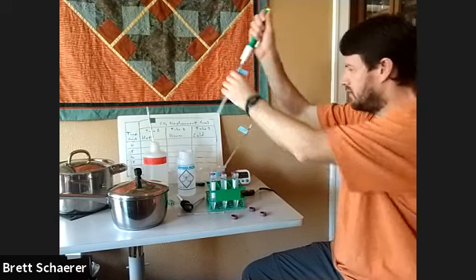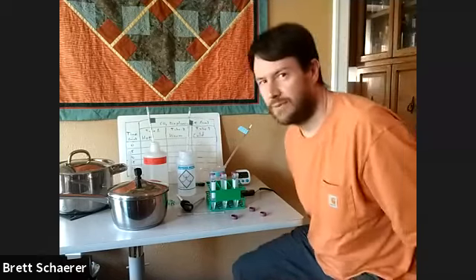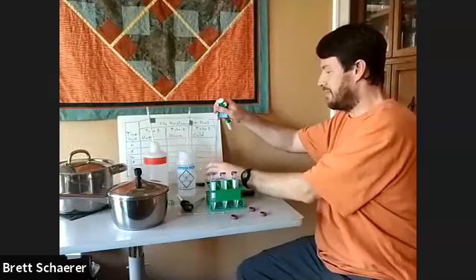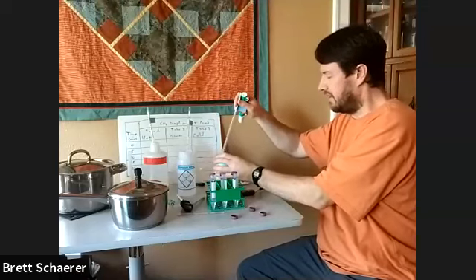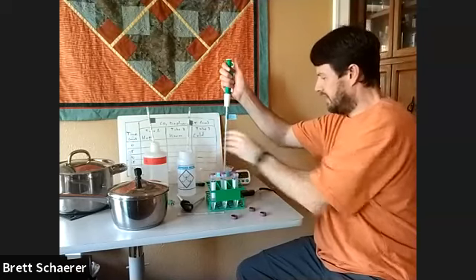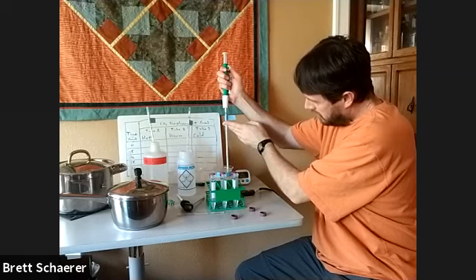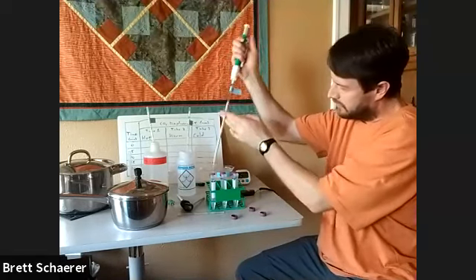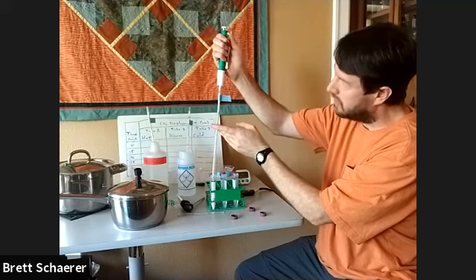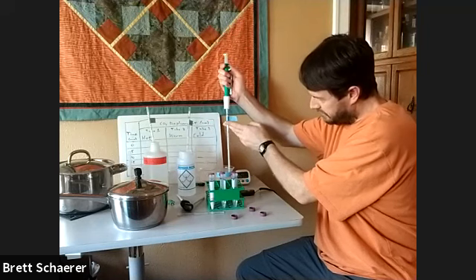And then I'm going to do 6 milliliters of yeast. This was the most effective amount of yeast from experiment 1. I think we can agree based on that data. So we'll add 6 milliliters to each of these.